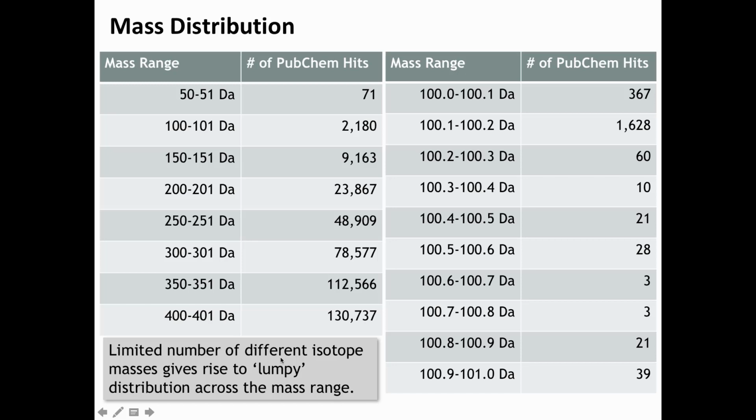So let's look at accurate mass search first. There's an oddity that many people don't expect, namely that the metabolites are distributed over the mass in a very uneven way. When you look at the number of hits in a certain mass range, then it's not unexpected to see that for low mass range you have few hits, and the number of hits gets much larger if you go into higher mass regions.